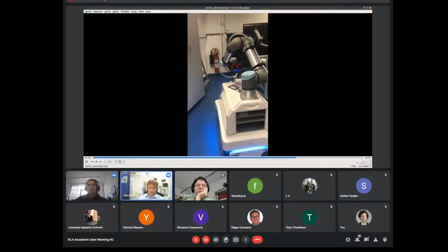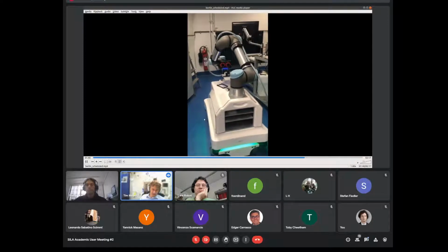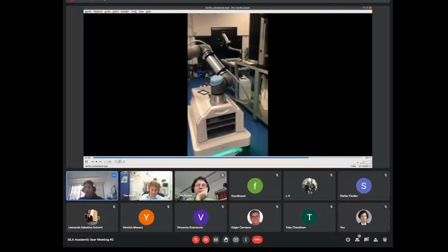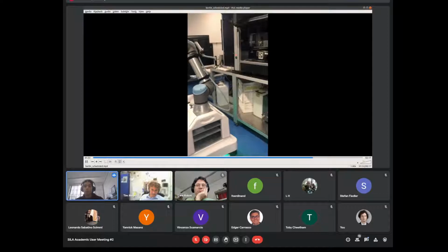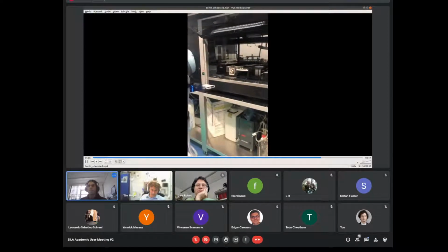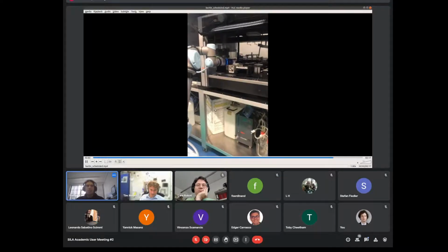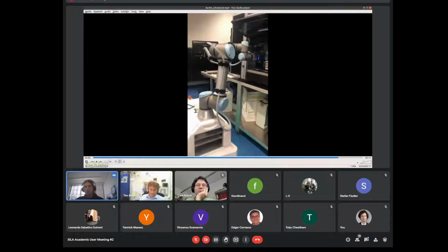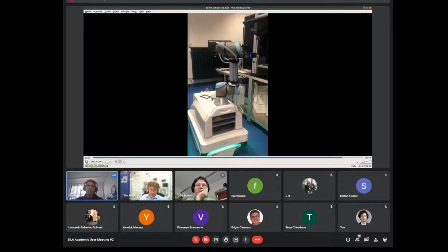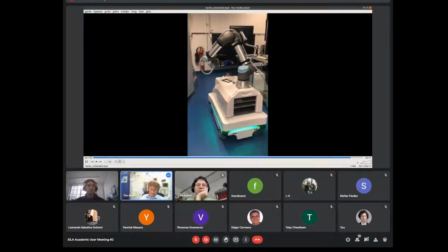But, sorry, Stefan, is it working at night on its own, or do you always have to have a person behind it? So it's supposed to work on its own overnight. The last overnight experiment was 1.5 weeks ago, but it's still too buggy, so this kinematic software, that it's not safe. So effectively, the person has to be there in case it doesn't work.